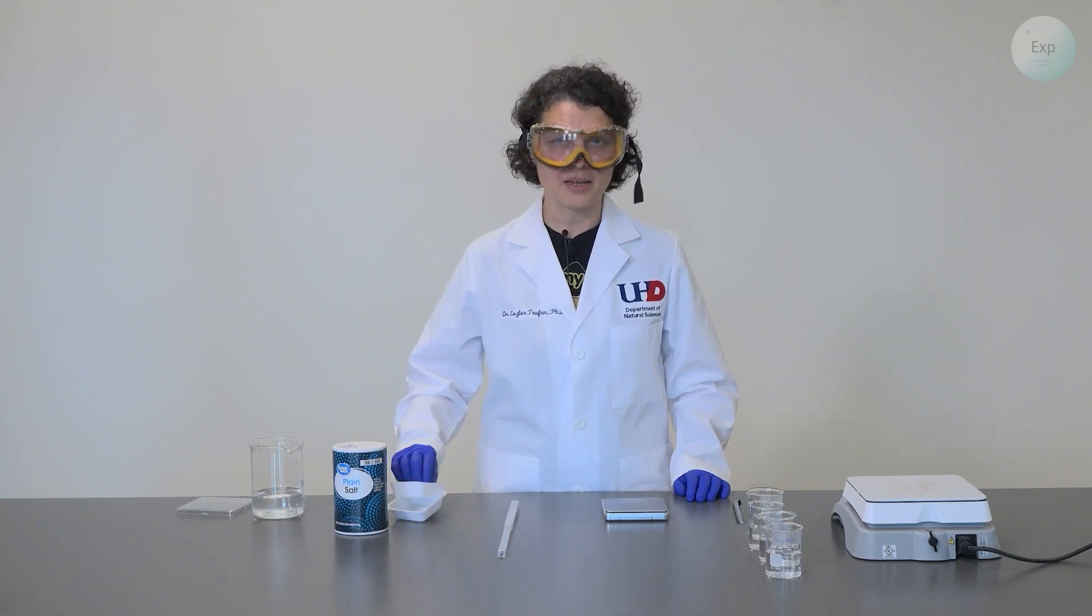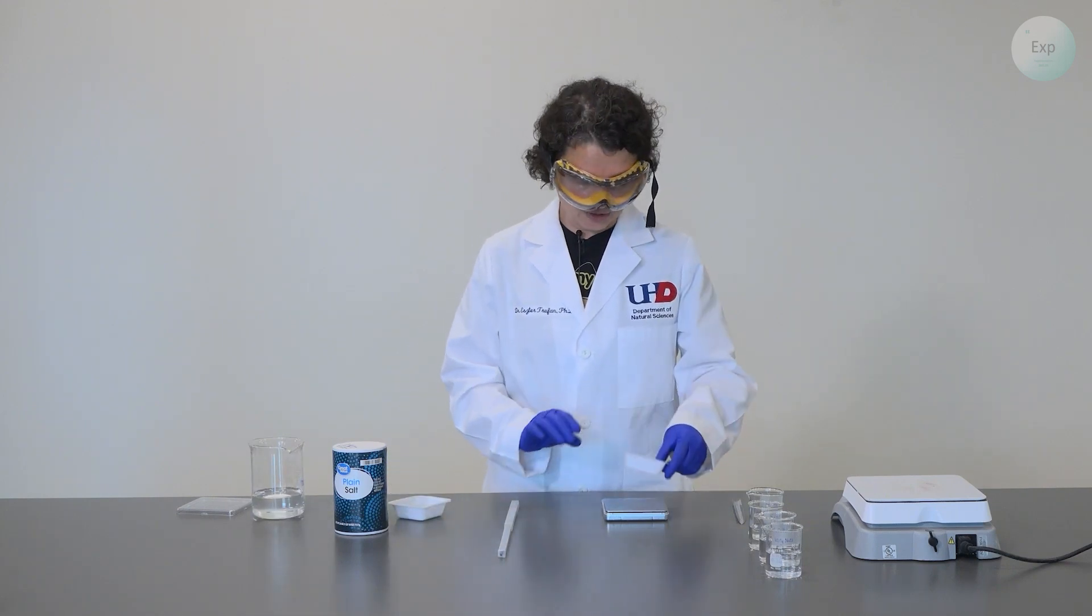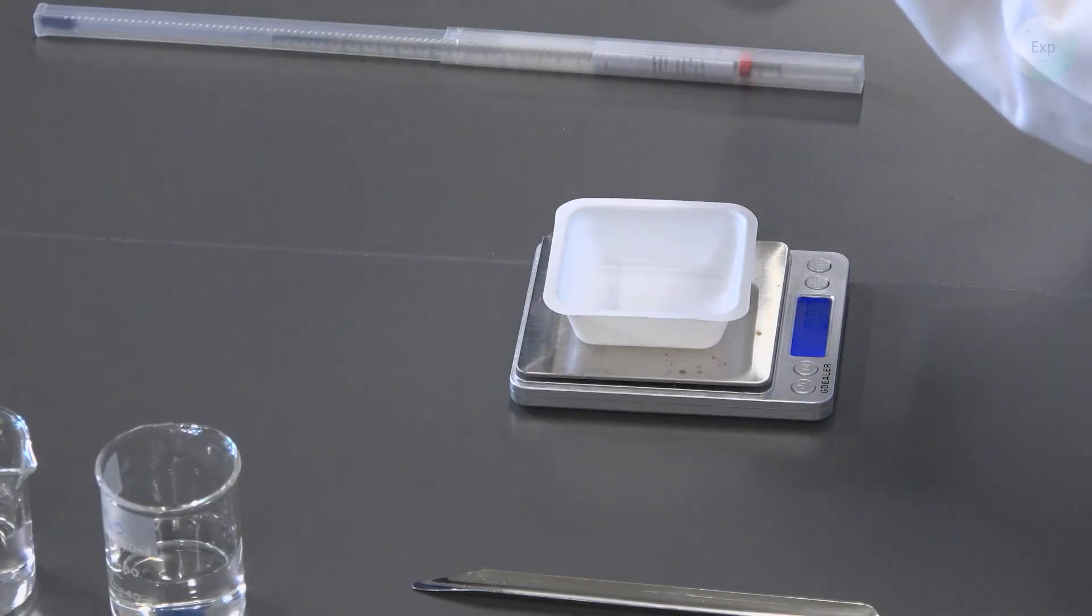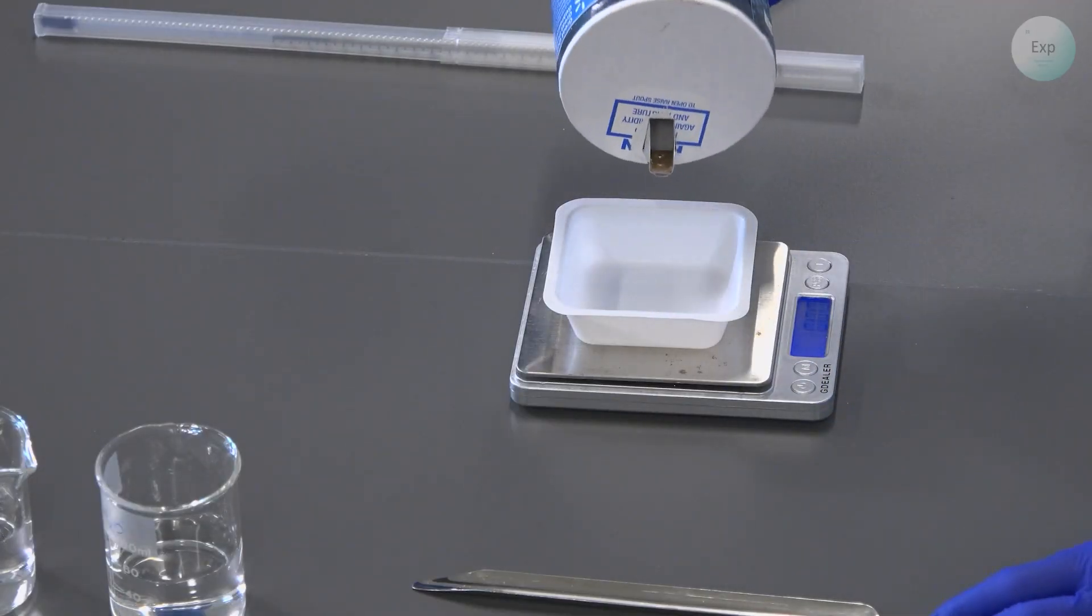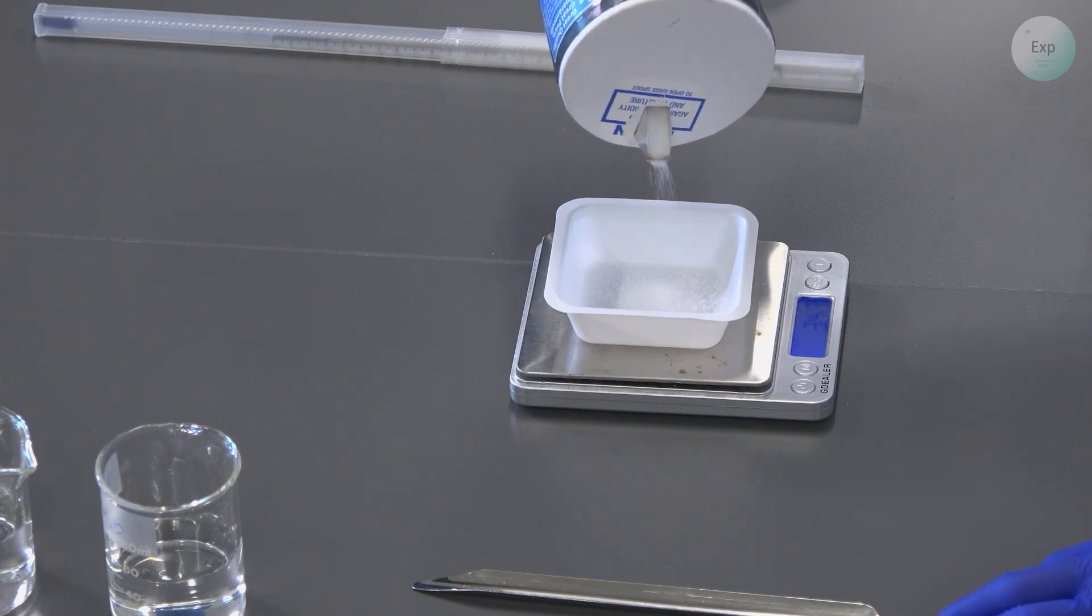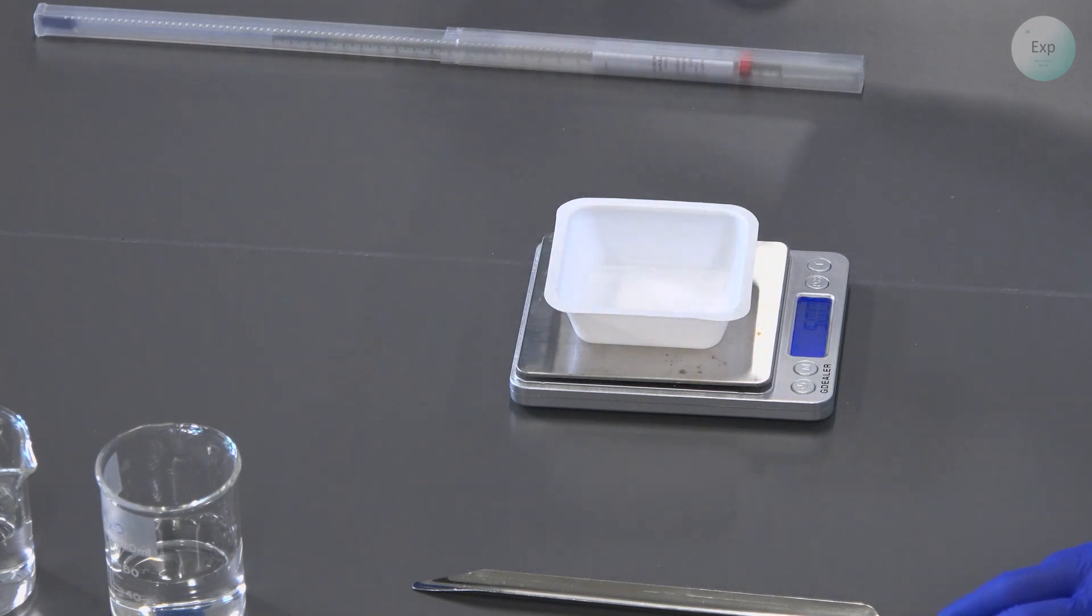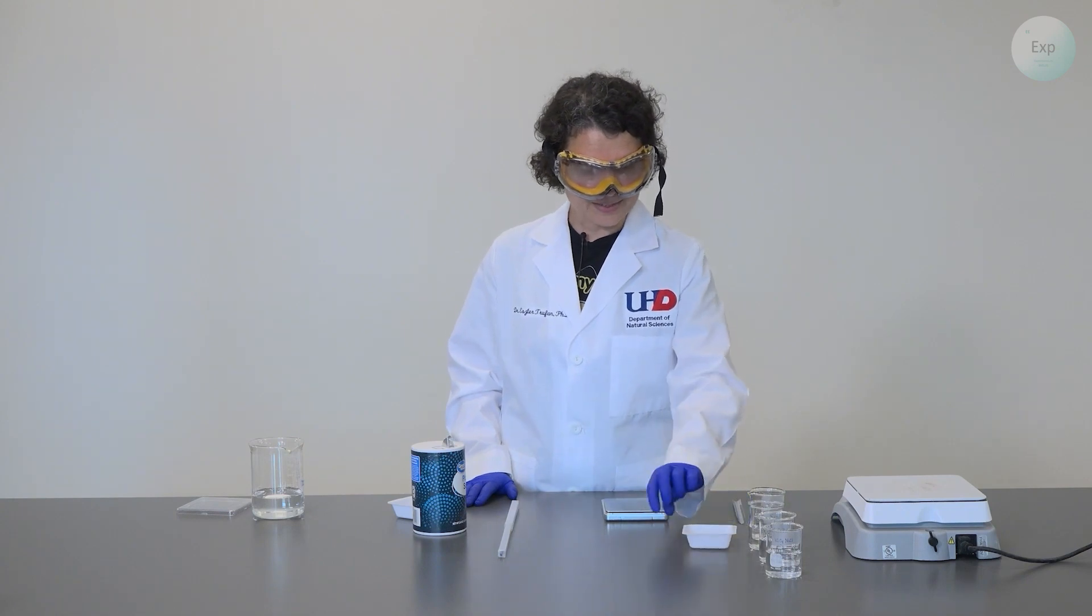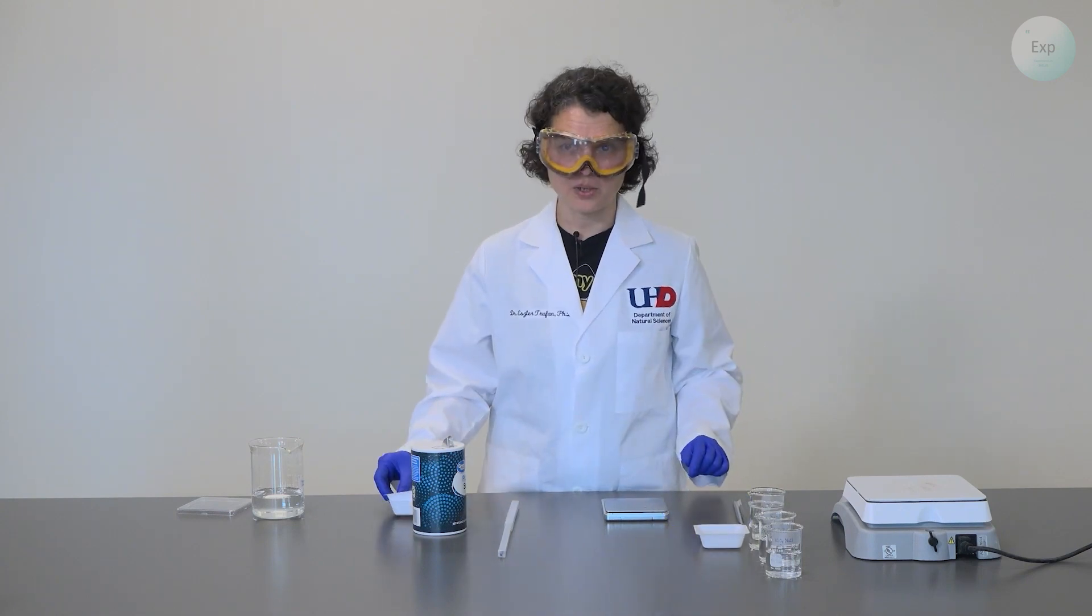Now I will measure out the amount of sodium chloride that will be added to each one. I will place my weighing boat on the scale, tare it, and then transfer 5 grams of sodium chloride to it. I have exactly 5.00 grams of sodium chloride. I will place it next to the beaker in which it will be transferred.